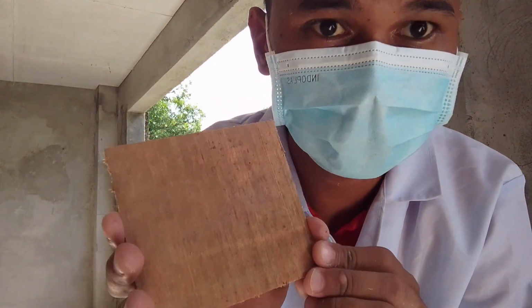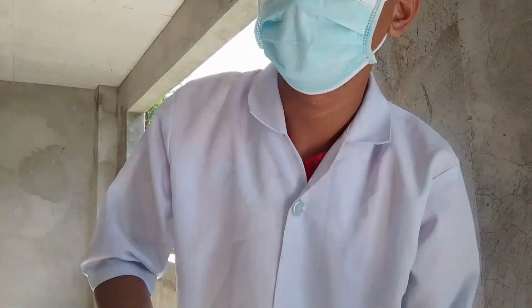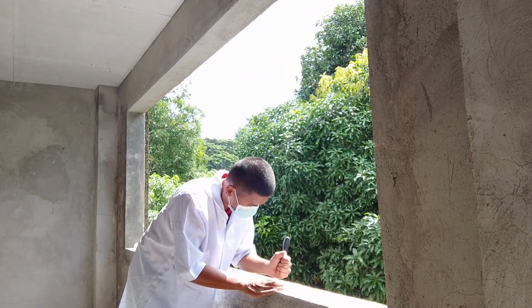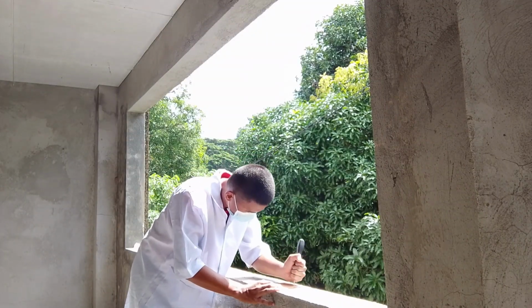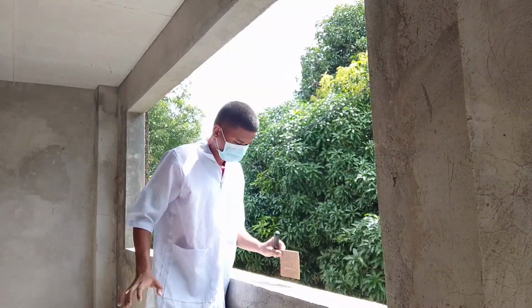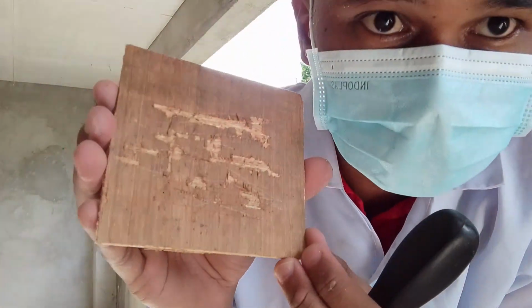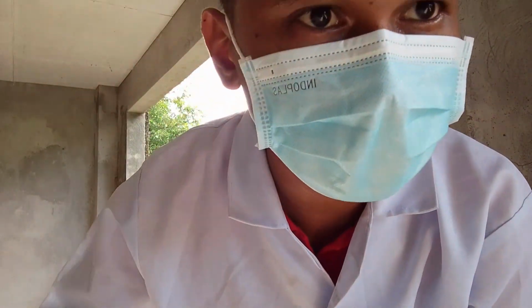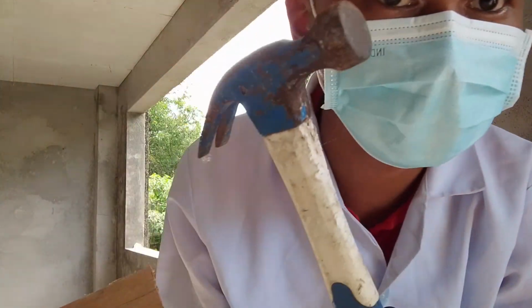Next, I am going to make an abrasion or friction mark. Here's the abrasion or friction mark. Next is the combination mark, and I am going to use a screwdriver and a hammer.